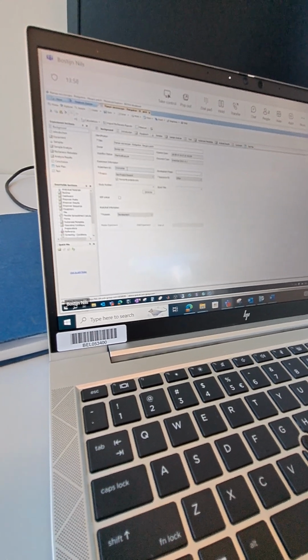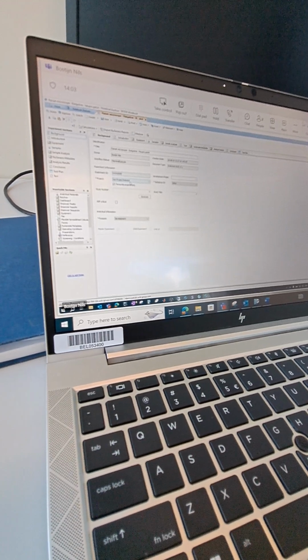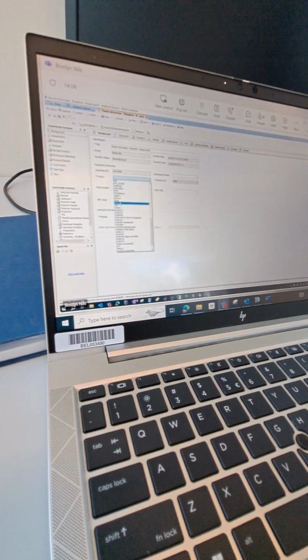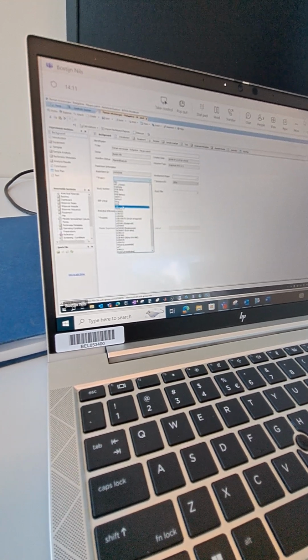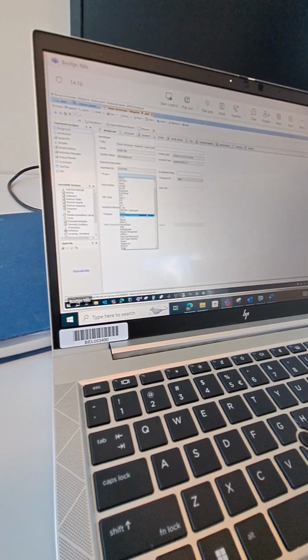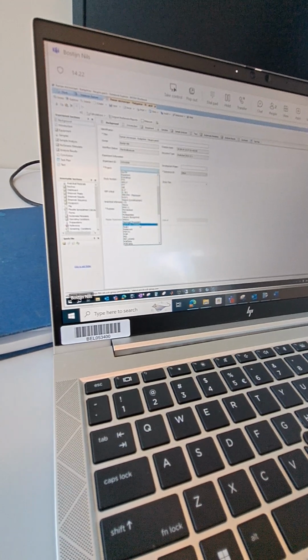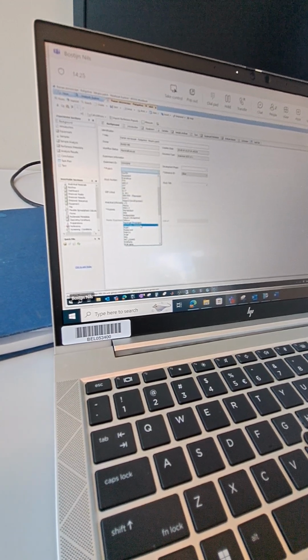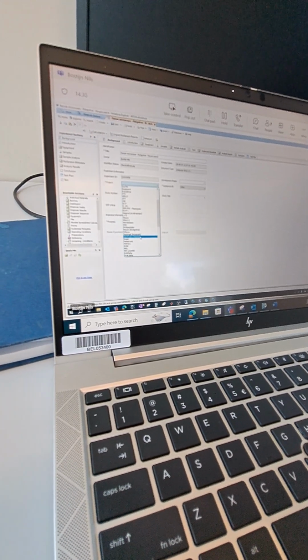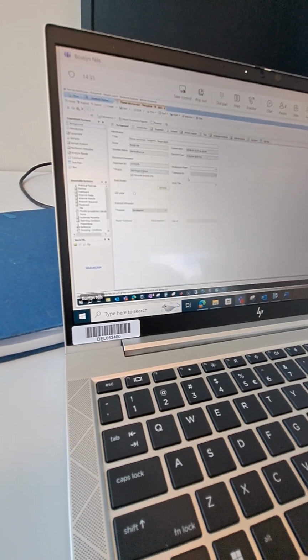Then there are three fields we need to complete ourselves. First of all is the project. Each one is a project in development. For you, you will need to select not project related, because everything is just development without a focus on a specific project, so we say not project related. Fine. You don't really work on a specific project.